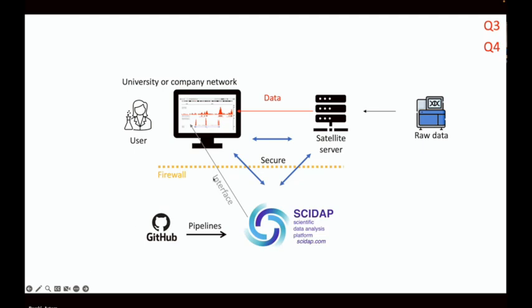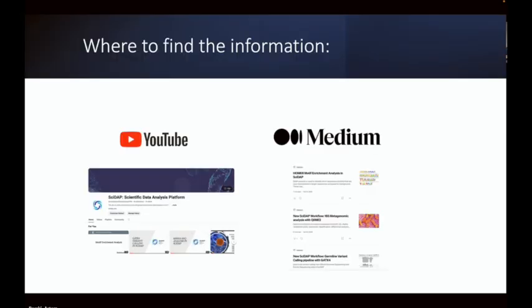Another advantage is we are controlling SciDAP.com, which provides the interface, and this allows us to update the interface and pipelines as needed, so you will always have the latest version available. If you want to see how to use SciDAP, we have a YouTube channel. You can search for SciDAP or Datirium. And we also have a blog on Medium where we describe the use of the pipelines.